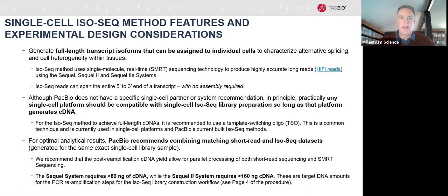So again, I won't read the slide to you, but if you're catching up on this, you can always freeze at this point and have a read through. But again, the same principles of ISO-SEQ apply. You'll end up with full-length transcripts with all the isoforms. There's no assembly or anything required.